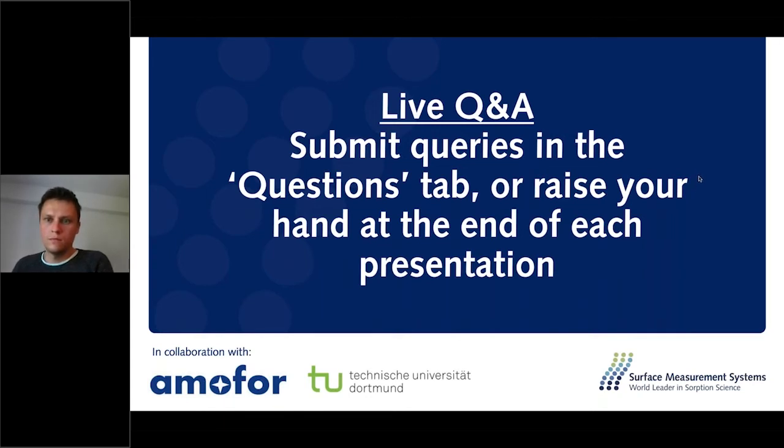So we have another question. How do you account for the polymorphic mixture crystallizing out of ASD for fraction crystallized using DVS? Well, this is a very specific question for the polymorphic transitions. In the end, we have to understand that we have different solubilities. We have the solubility of the one polymorph and the other polymorph, and they differ slightly depending on the different crystal properties, because the polymorphs have slightly different melting enthalpies. And then we need to understand both. But in polymorphic transitions, I must admit it is very hard to really clearly and precisely account for that.